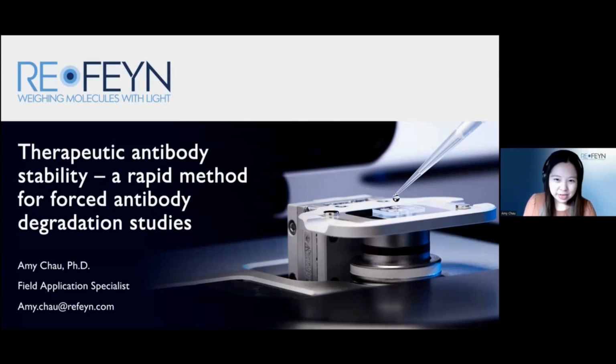Thank you, Rory, for the kind introduction. Hello, everyone. Thanks for attending today's seminar. And I will present two case studies on how mass photometry can be used to assess antibody stability.